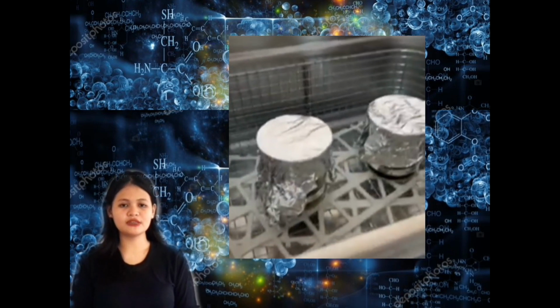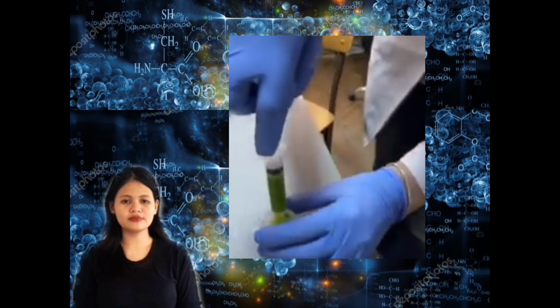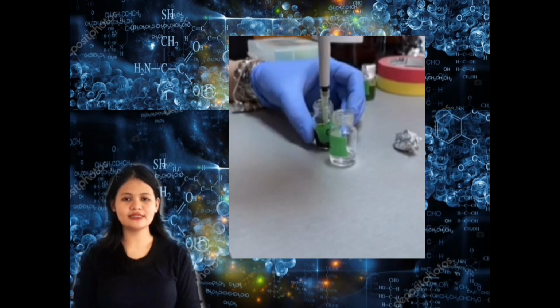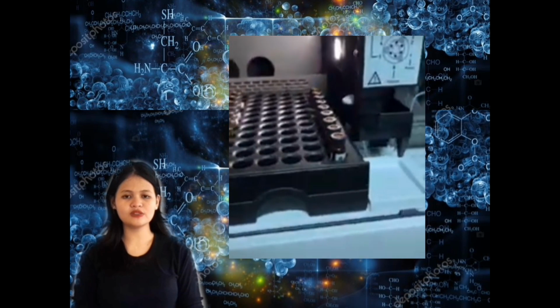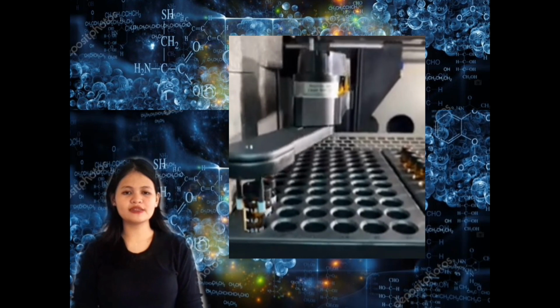CUPRAC was measured using a mix of CuCl2, neocuproine, and ammonium acetate buffer. TAC was performed using ABTS 7.5 millimolar reagent with the first absorbance at 734 nanometers. The second absorbance reading was performed using 5 microliters of sample or Trolox standard. Results were expressed as Trolox equivalent.